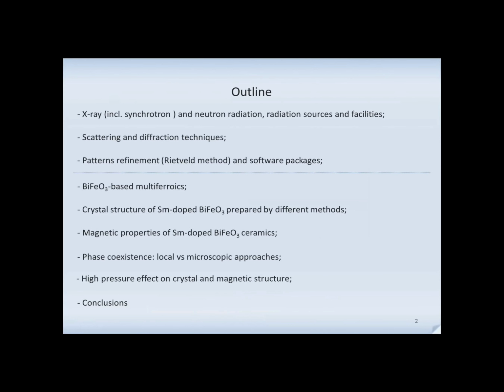So briefly the plan: some words about sources of X-ray diffraction, how to produce neutrons, something about synchrotrons also, how to produce diffraction and scattering, and how to refine diffraction spectrums with some software. And the second part is my original research.